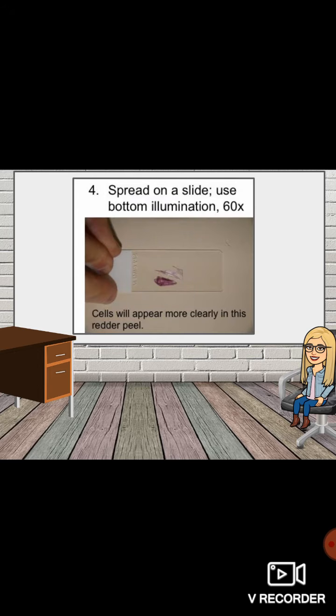Spread on the slide, use bottom illumination. Cells will appear more clearly in the thinner peel.